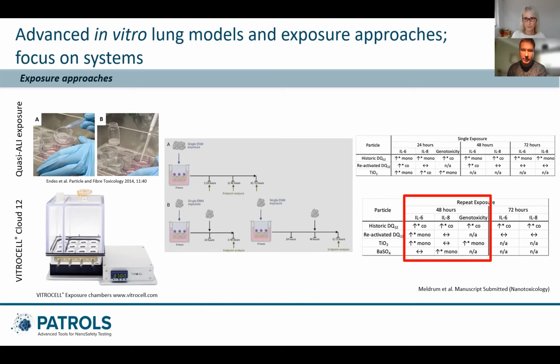And what we found when we looked at a specific set of endpoints, specifically pro-inflammatory mediators and micronucleus assay to assess genotoxicity, we found that actually 48 hours repeated for the variety of different materials that we exposed in this small study was the best way forward and gave the best sensitivity of this model.